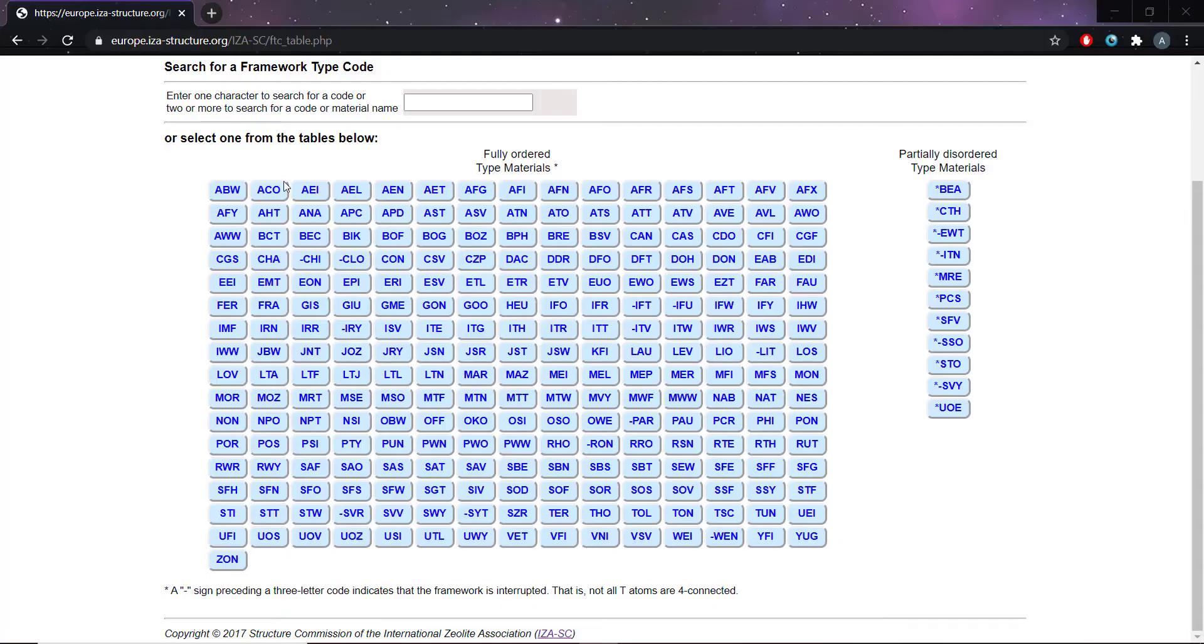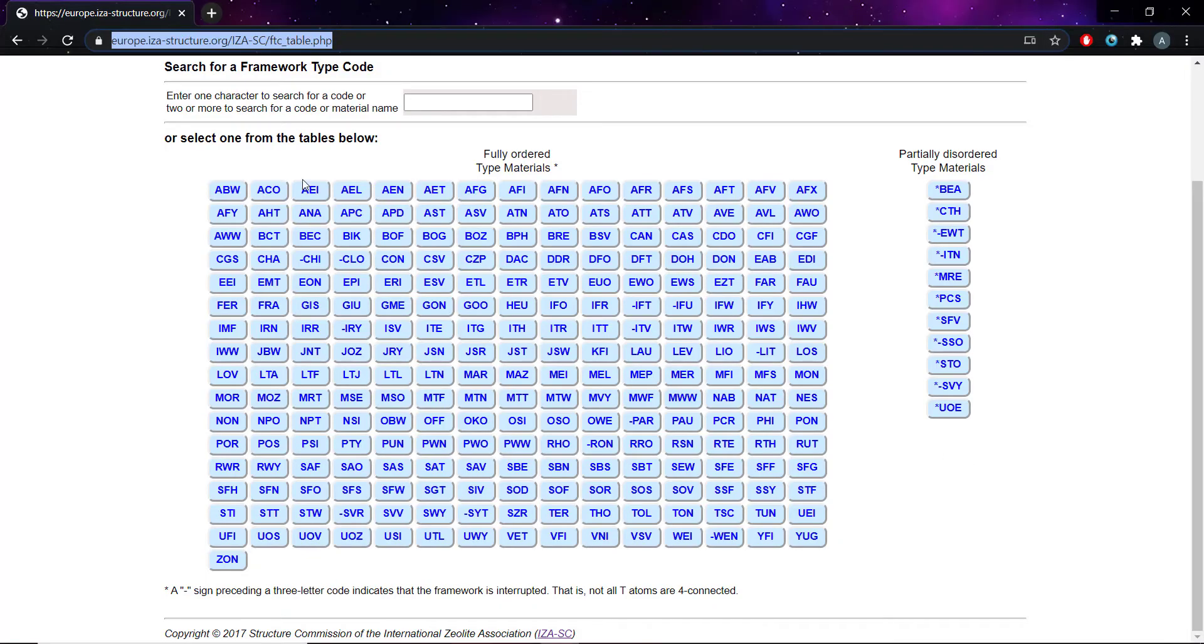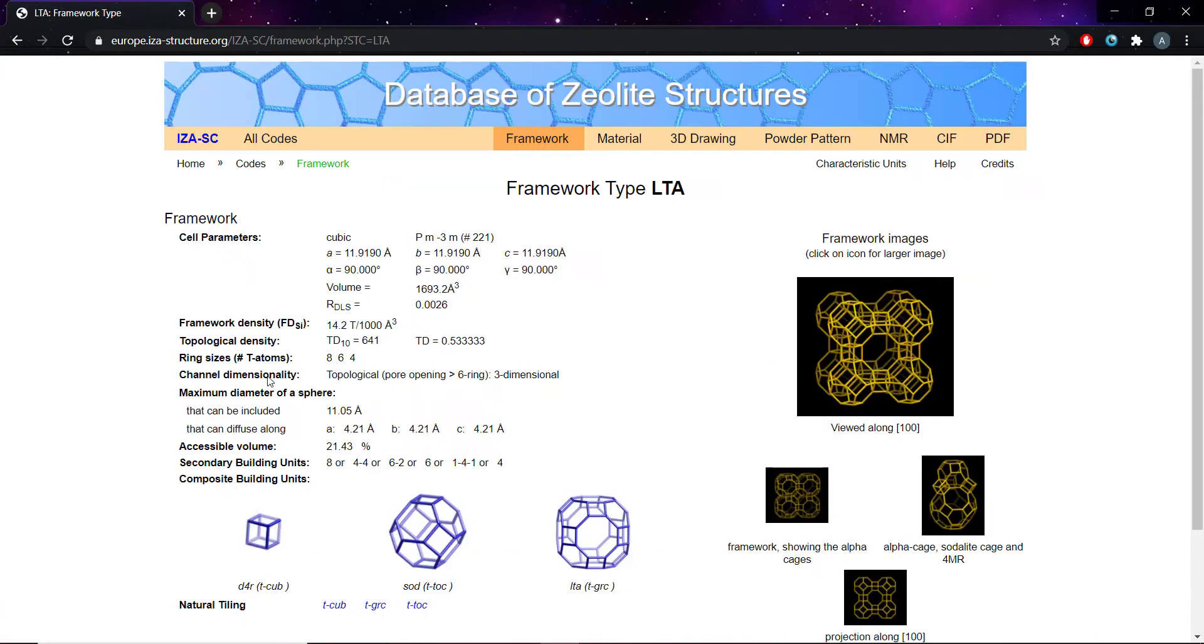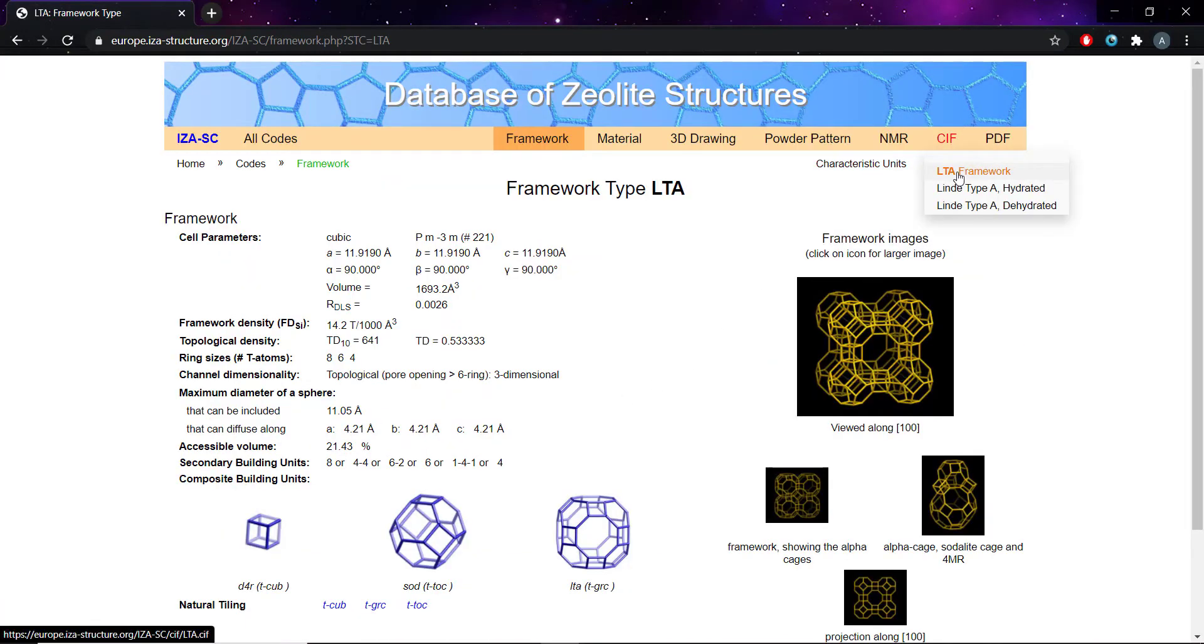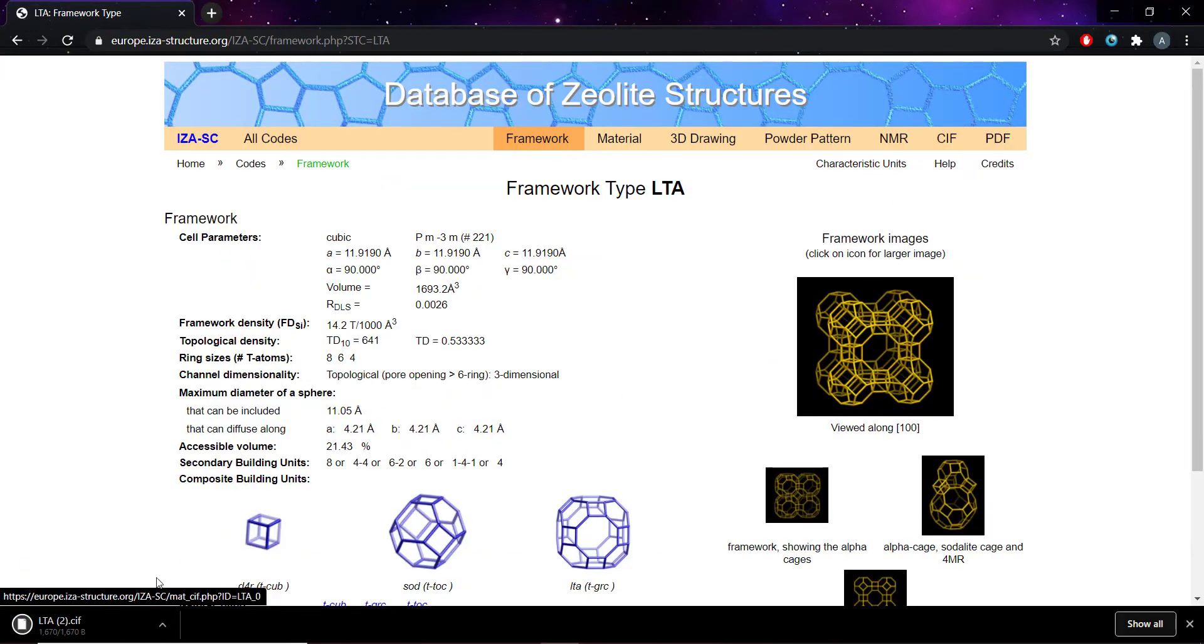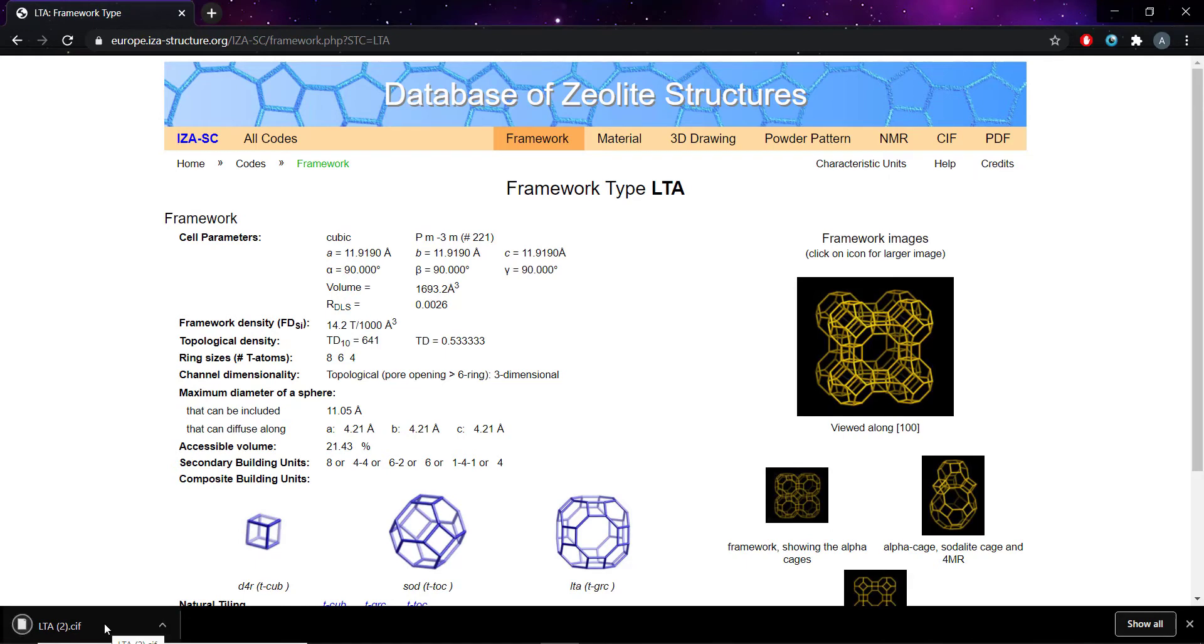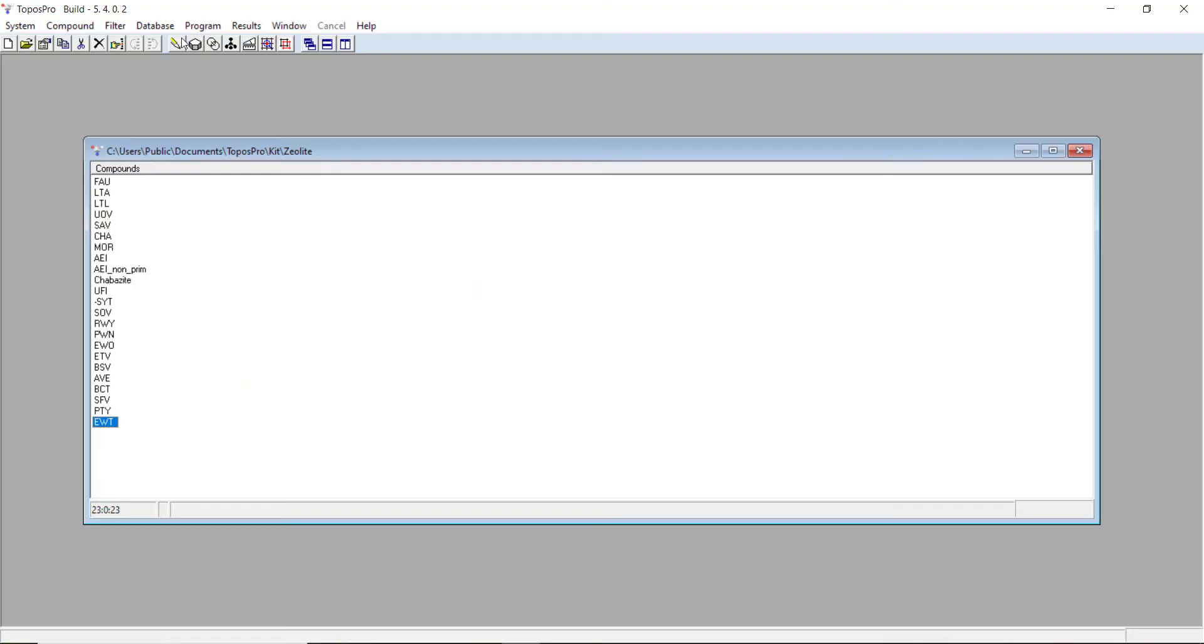If I go to the IZA website, you should hopefully be familiar with this, and I navigate to LTA, this is zeolite A. I'm going to download a CIF file for it, and then I'll import it into my database.